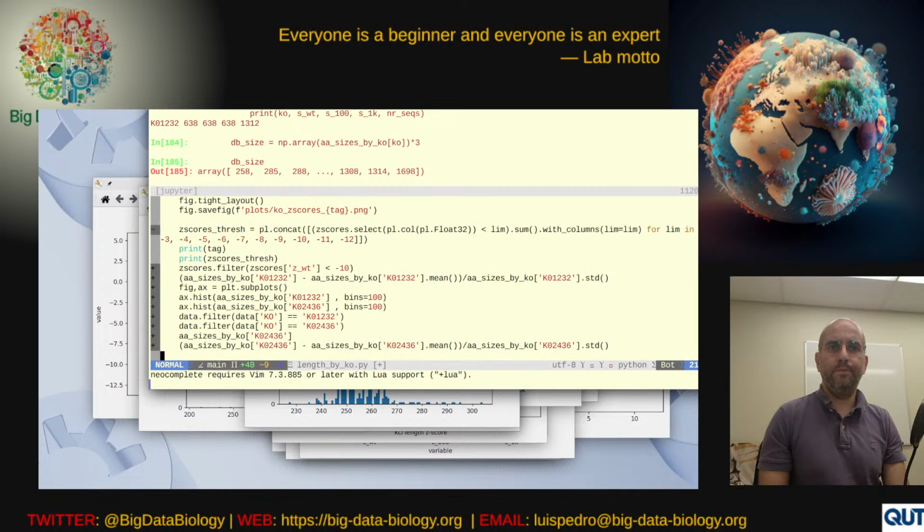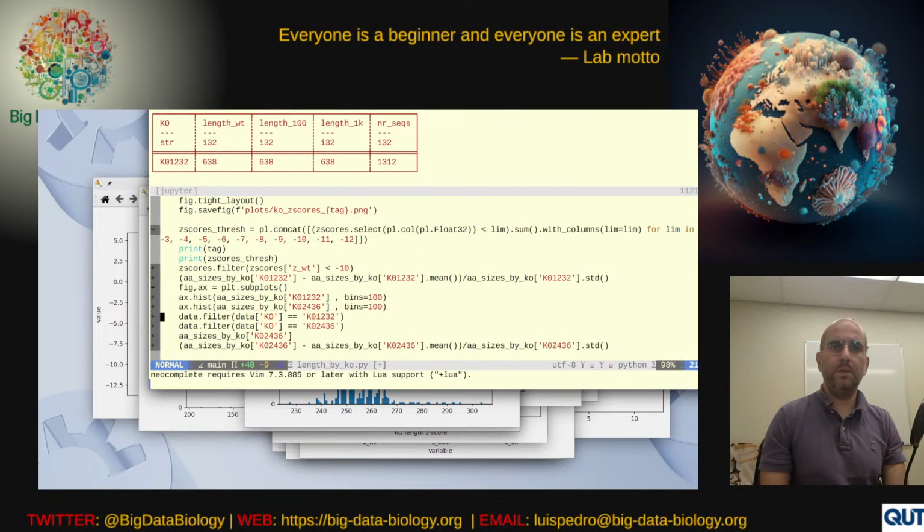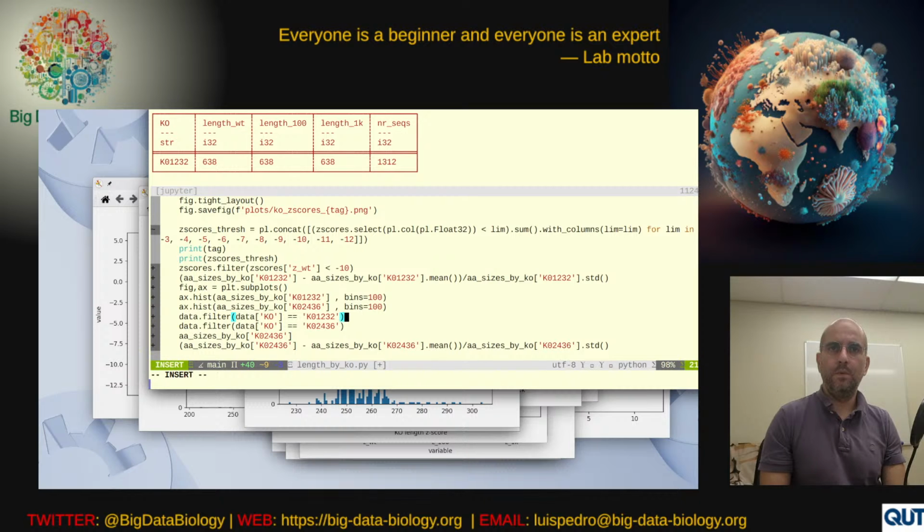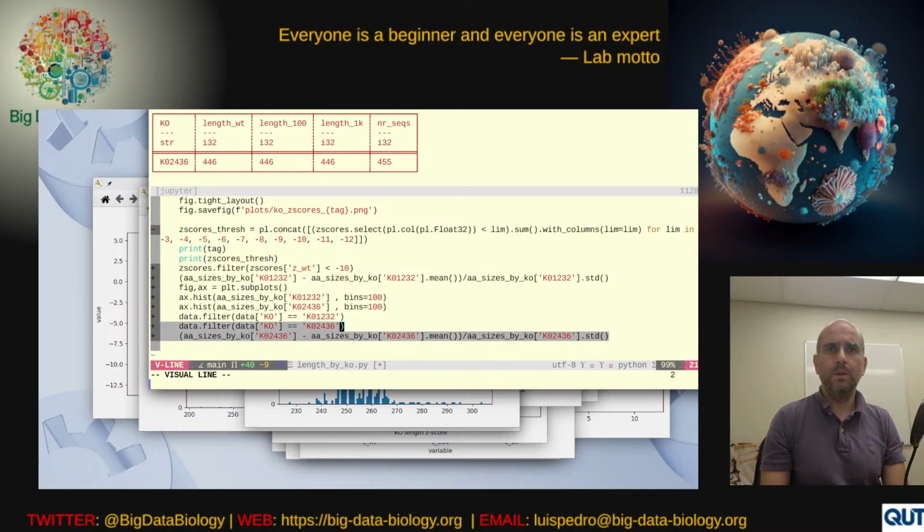so this makes sense because this is nucleotides. So yeah, this is nucleotides, so it makes sense, because 638, so this is about 200 something. Alright, so this makes sense. And this, right, so these two small hits. Huh. Okay. To be continued.